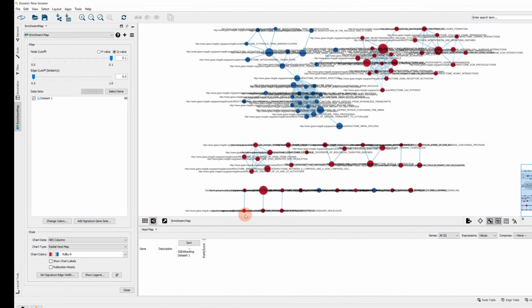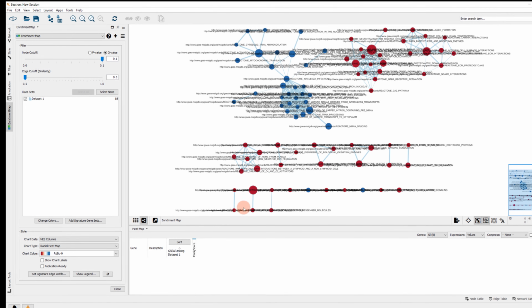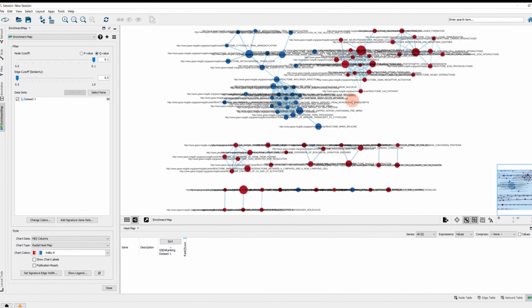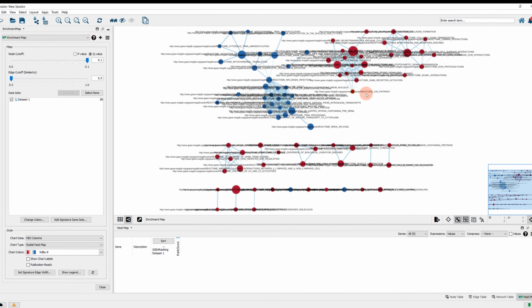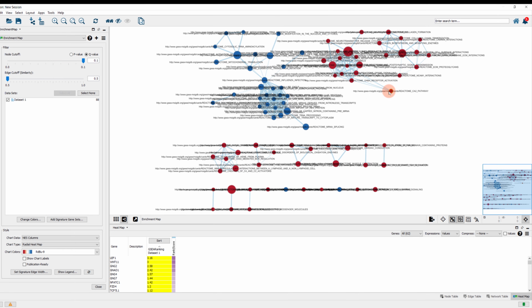So we'll go to Cytoscape. Oh, and there we go, that's your enrichment map. A bit hard to look at initially because of all the writing. But what you can do is you can click, these are nodes, you can click on these nodes and drag them so things become a bit clearer.